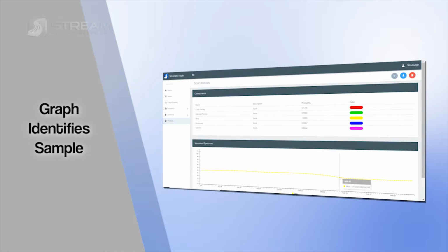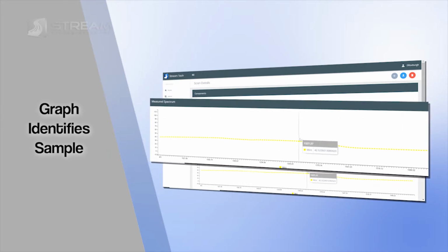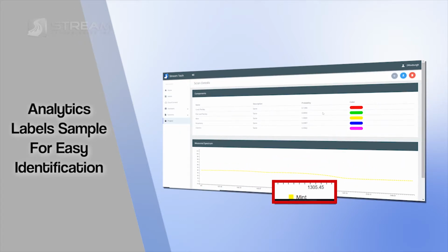If you want to see how well it identified it, we can look in the View Details screen again. Here we'll see a plot showing the spectral scan that we just took. It's been colored to match the component that it identified as, which in this case is mint, and we set that to be yellow when we set up our solution.